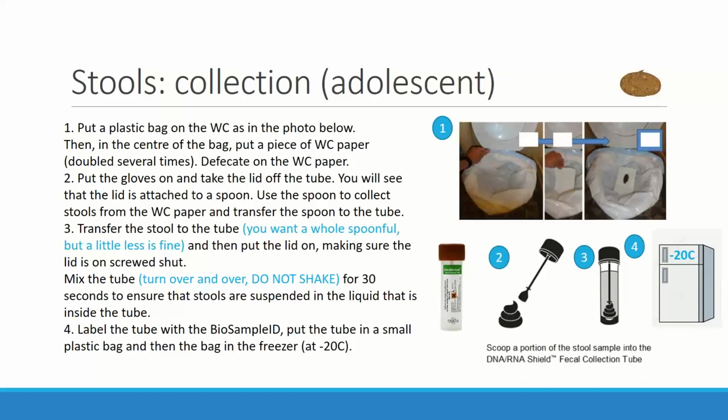A bin with a plastic bag that will be, sorry, I have my son here that needs to go to the doctor afterward. I think that we can add this, that it was just a practical thing. And the same plastic bag will be used afterward to throw everything away. I think that we can add this to the protocol.